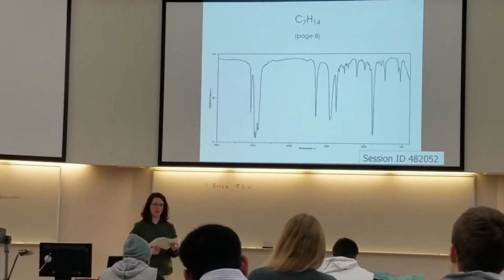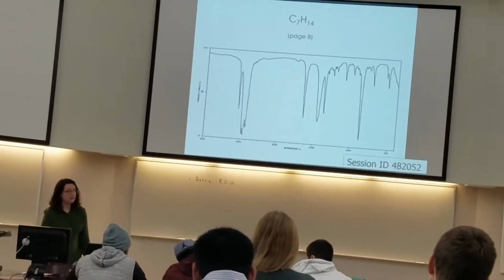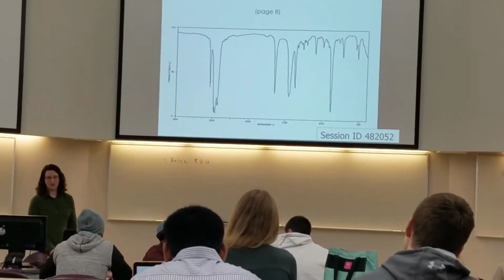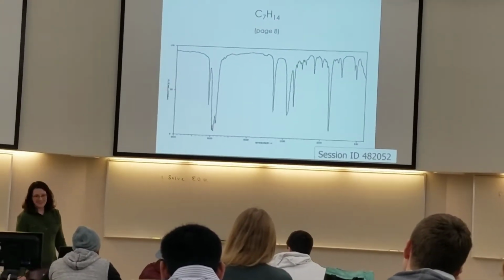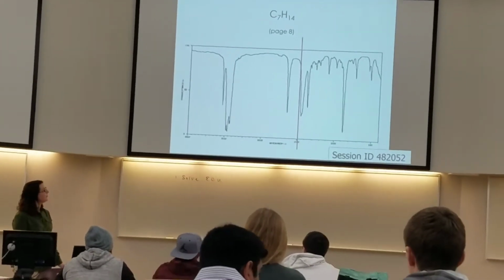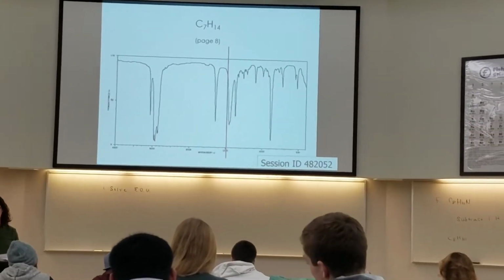Not there, then we're going to think about our rate for one element of unsaturation. Okay, so look at the spectra. First thing to do, what do you do when you look at a spectra? Find 1500 and draw a line. Good. So that's about right there in the spectra. And that helps focus your attention on the left-hand side, the functional group side.